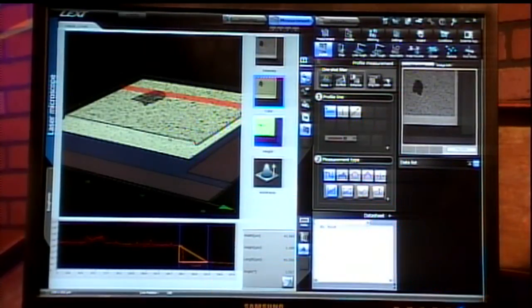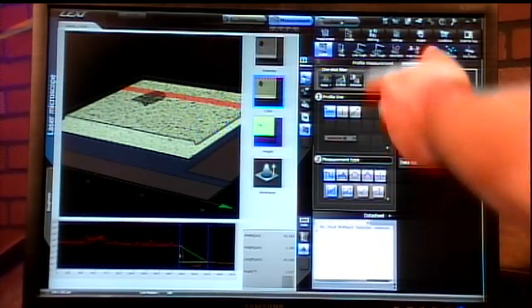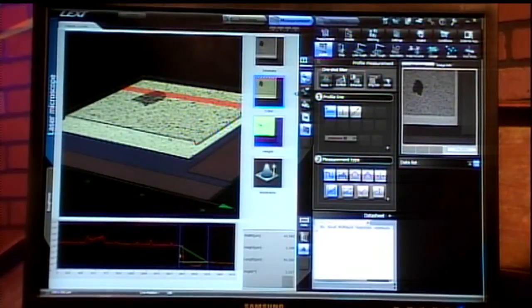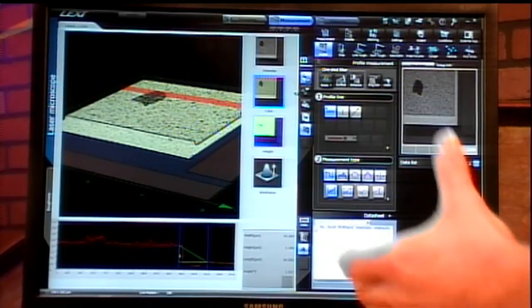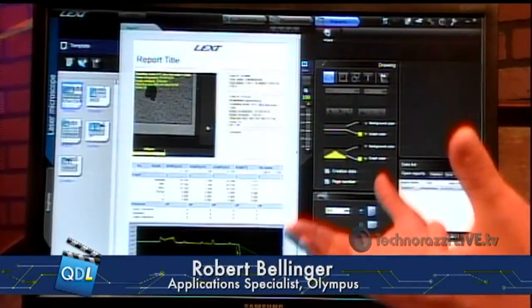All of this information, once you capture it, is single button clicks — capture your measurement value — and then you move on to your reporting at the top. Another single button click takes all this information and drops it into a predefined report template for you, so you can export these report templates to PDF very quickly.